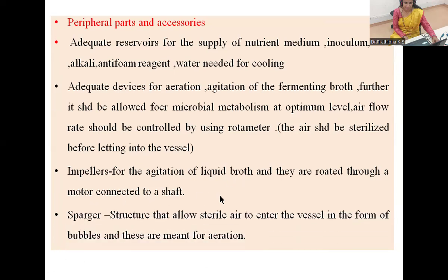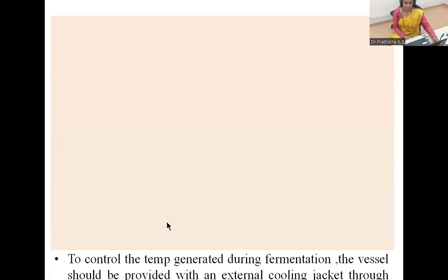connected to a shaft. And the sparger, sparger means this is a device, a structure that allows sterile air to enter into the vessel in the form of bubbles or gas bubbles, and these are meant for aeration purpose, right? Impellers for the agitation, spargers for the aeration.